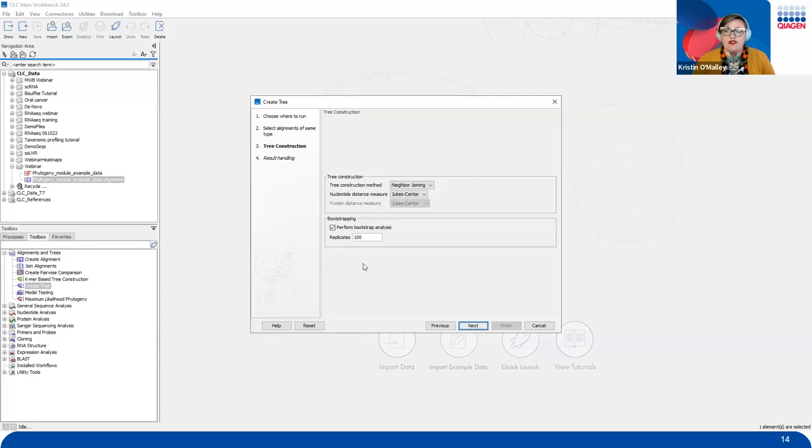Another thing that you might notice is as I'm hovering over specific things in these options, you will also get a nice little tooltip just quickly explaining what these different options are if you don't want to get into that help menu right from the get-go. So once we are satisfied with our options, I'm going to go ahead and click on Next.